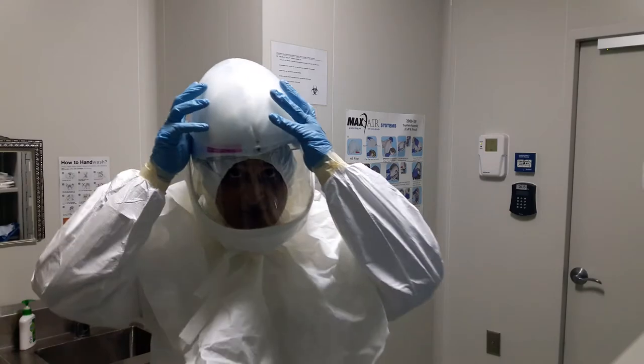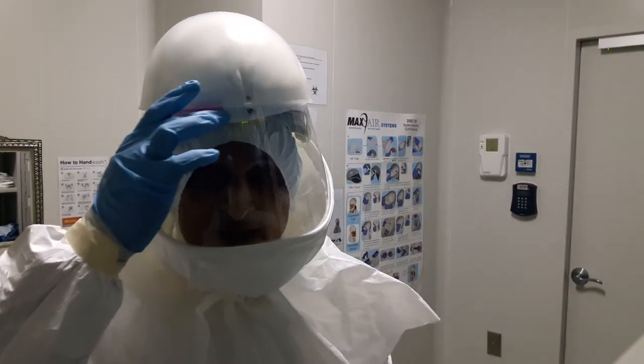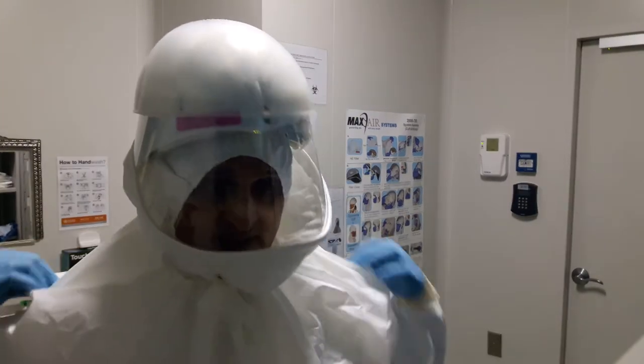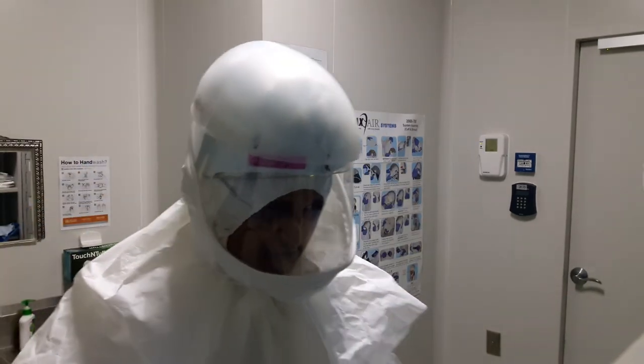I will do a brief check on my power — there is a lighting indicator here which I can see. There are three lights, and when they are all lighted up it means I am powered up and ready to go into the laboratory workspace.